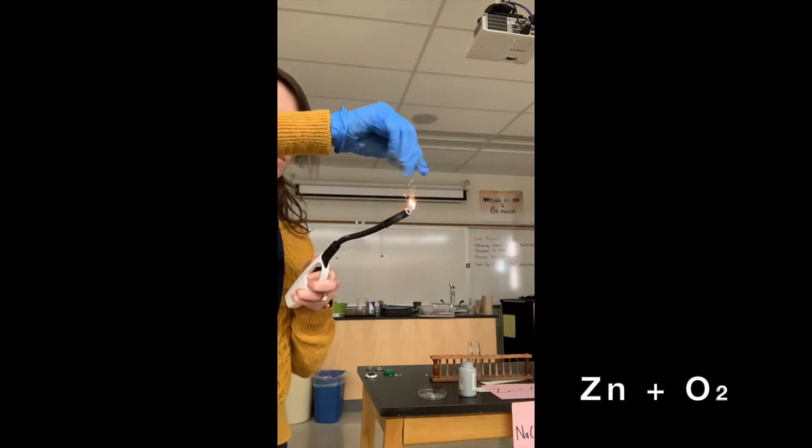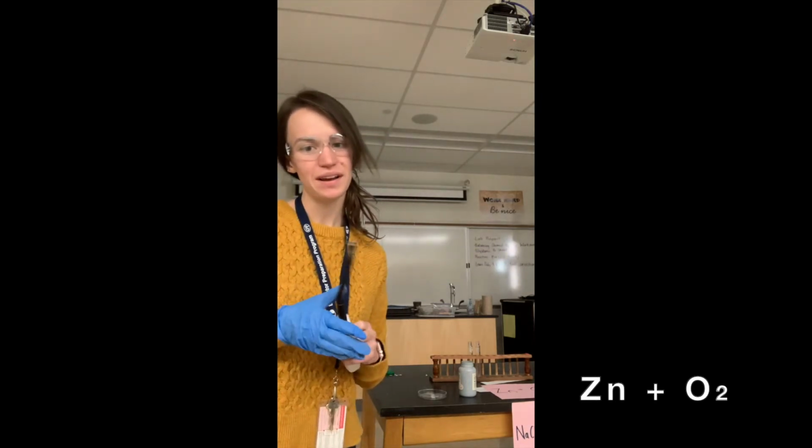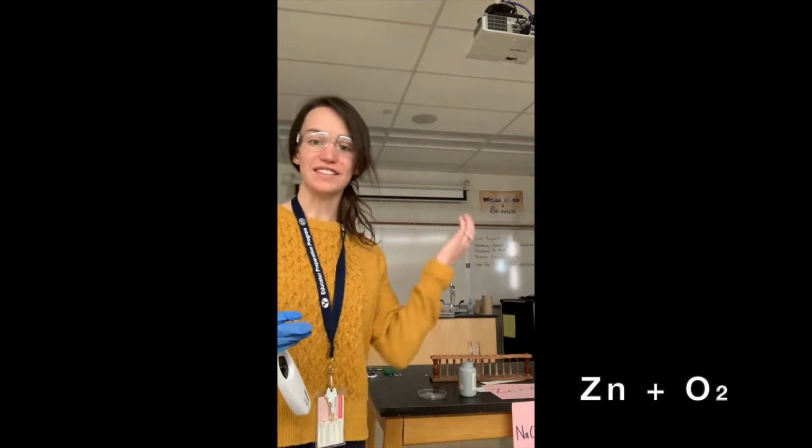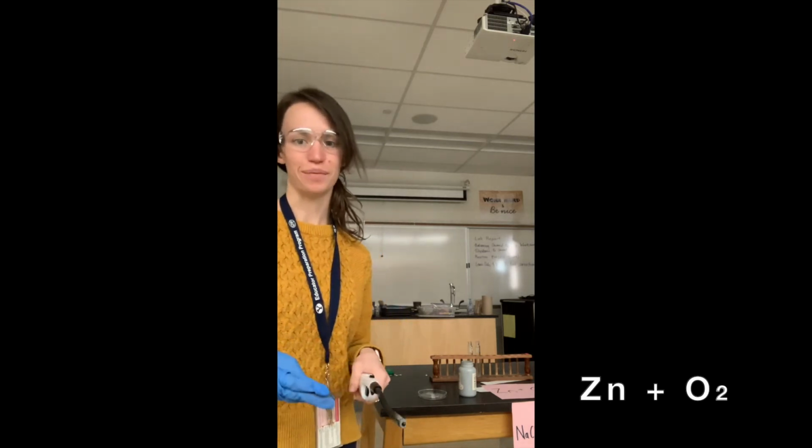Alright, so write down your observations for that one, then try to do number 3. Number 3 is really hard for all of these, so I'm going to make a separate video where I answer number 3 for you, so you can check that if you need help on number 3.